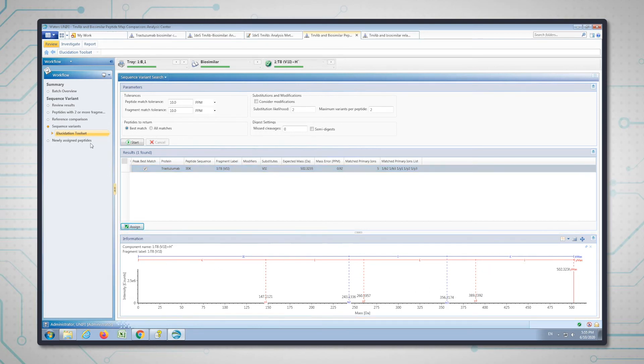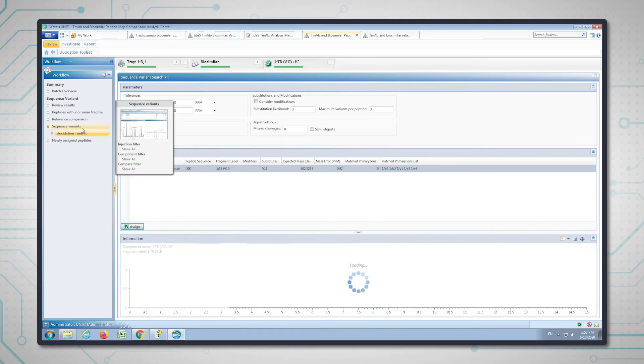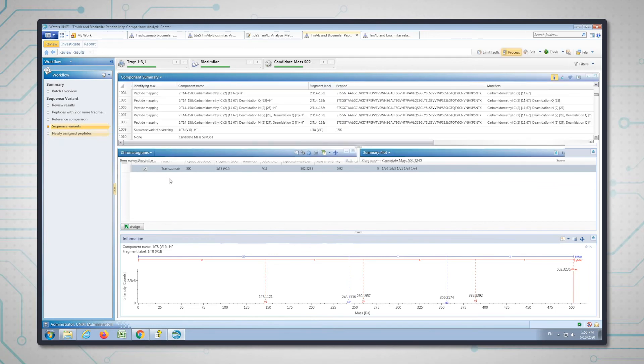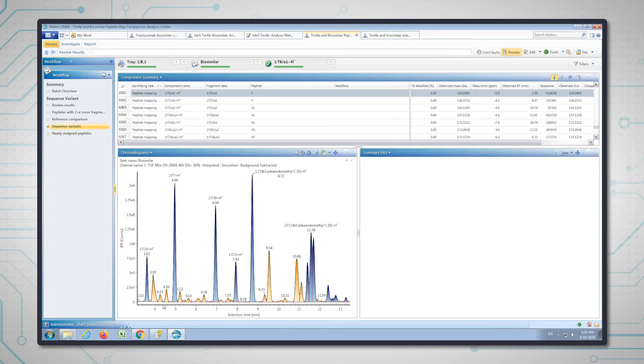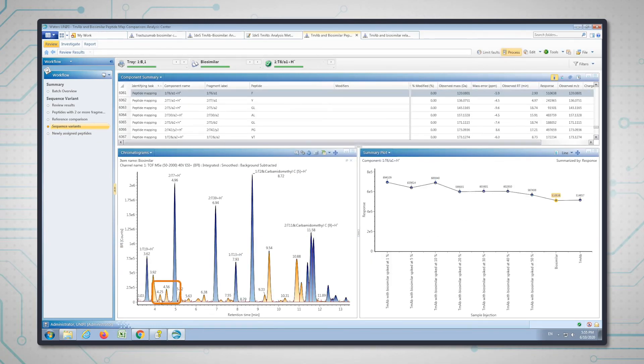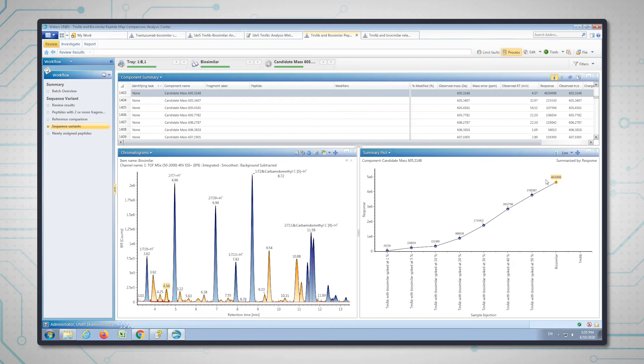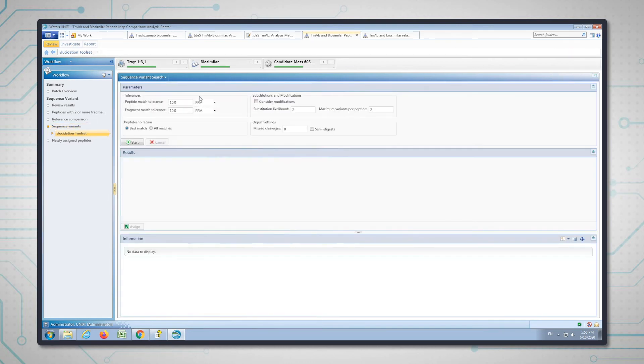I'm going to go back to the sequence variant step and we're going to look at the other peptide that we want to target, which was at 4.56 in the chromatogram. This time we have a candidate mass of 605.31, and we can see we're observing the same pattern in the summary plot where the response of this peptide is decreasing with the decreasing amounts of the biosimilar. That's a good candidate, so I'm going to do exactly the same thing now—I'm going to click elucidate and run the sequence variant search.